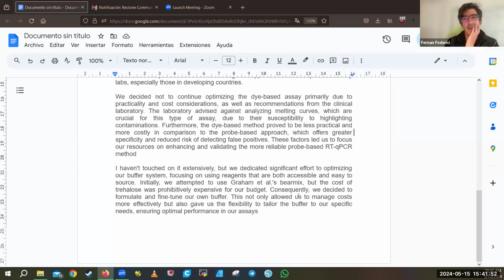I agree. I think that there are many enzymes and components in the collection that sometimes could be helpful, and I agree that having access to, for example, MMLV and HIV RTs, and then BST and OpenVent and PFU, and also the OpenTaq now, is very useful because it's what most people will require, and that's okay. But then, for example, in other projects, we had a problem: we wanted to express a lactonase for another project related to biophysics research, and we couldn't get it to work.